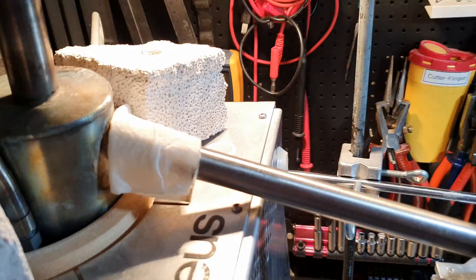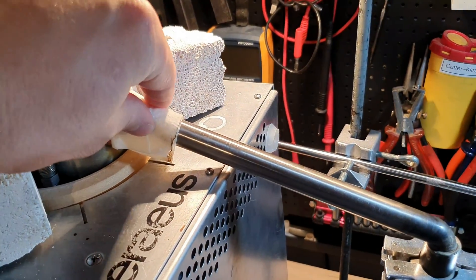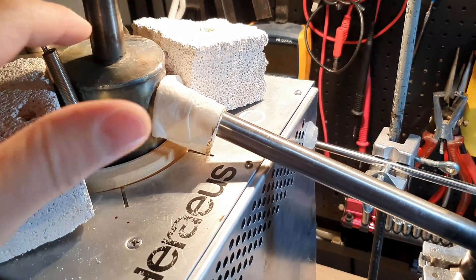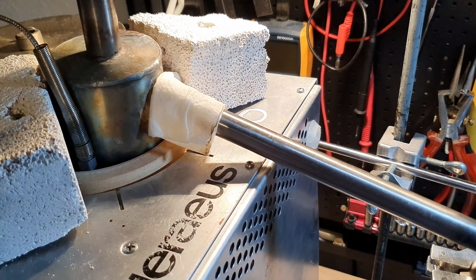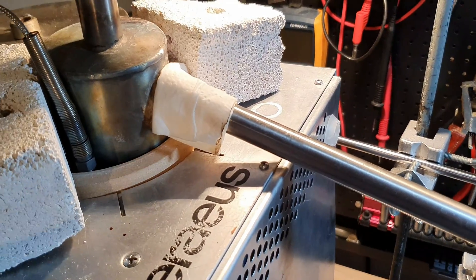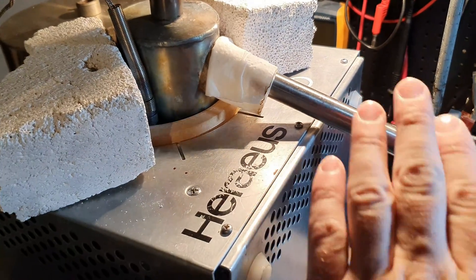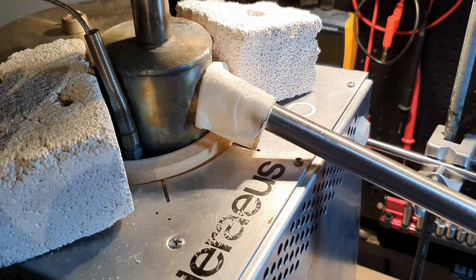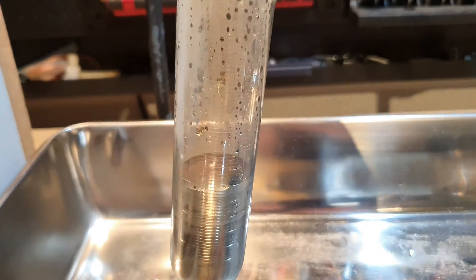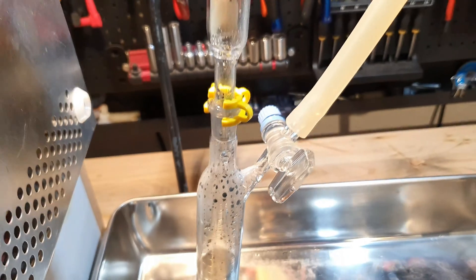One thing I'm doing is cooling the condenser right here so I don't risk distilling over any lithium. Lithium has a melting point of around 180 degrees Celsius, and by keeping this cool I can at least make sure that no lithium gets into my receiving flask.